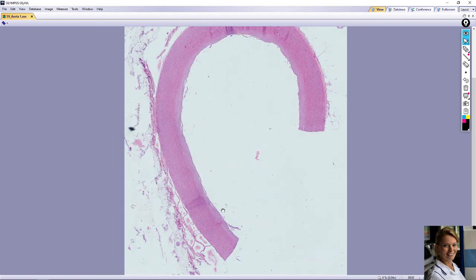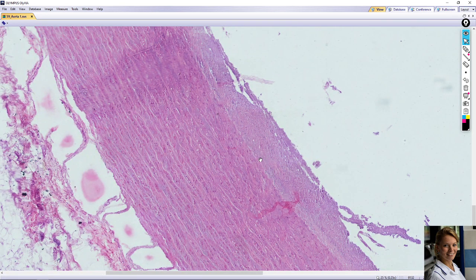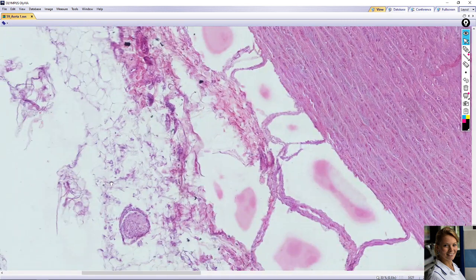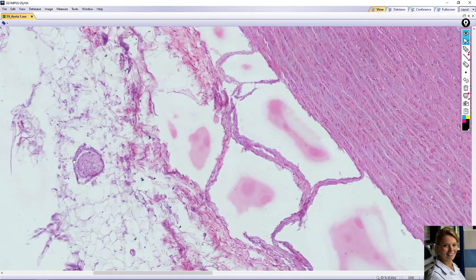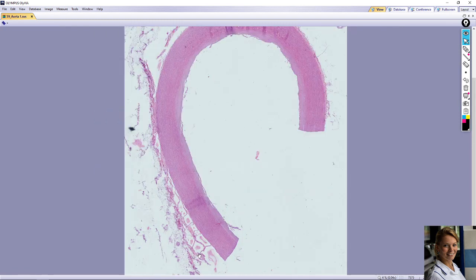So that's all for the elastic artery, especially the aorta. The innermost layer, tunica intima, is lined with one layer of endothelial cells and subendothelial loose connective tissue. In the tunica media you can find thick elastic membranes, smooth muscle cells, and fine collagen fibers. The outermost layer, tunica externa, contains collagen and elastic fibers, fat cells, muscle fibers, nerve fibers, and small arterioles and venules. Thank you very much for your attention.